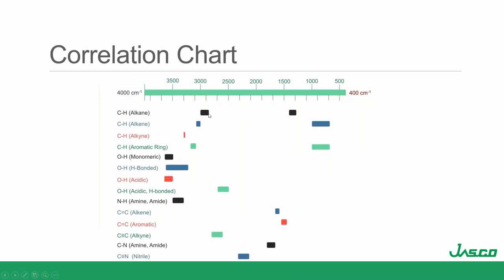So as I said, one of the advantages of IR is being able to identify functional groups. So an alkane molecule is going to have CH stretches around 2800. Now an alkene will be a little higher, and with the alkyne it'll be even higher. So knowing this, this is a correlation table, allows you to see what bonds you have. Sometimes that's important for some sorts of reactions when you want to monitor reactions. So you can see a double bond O, for example, turn into an OH.